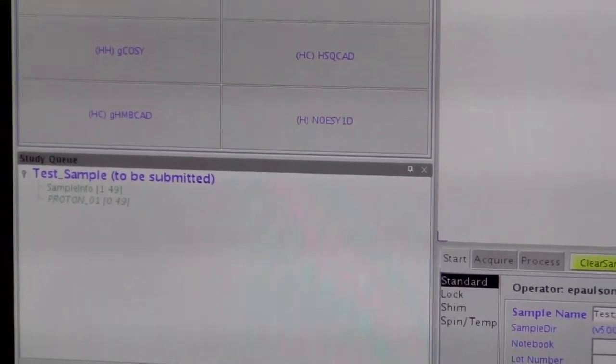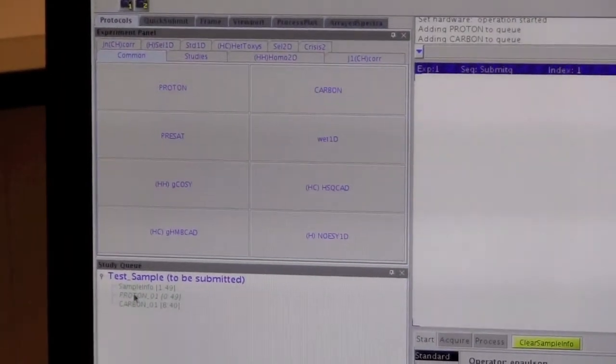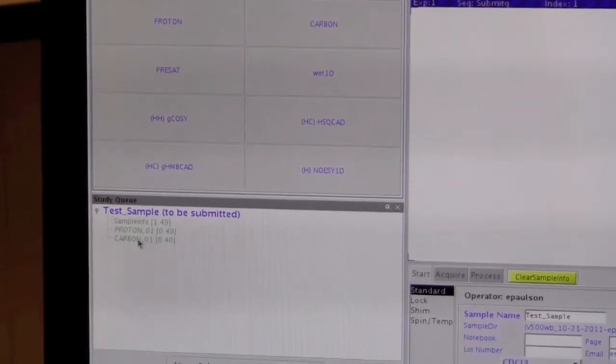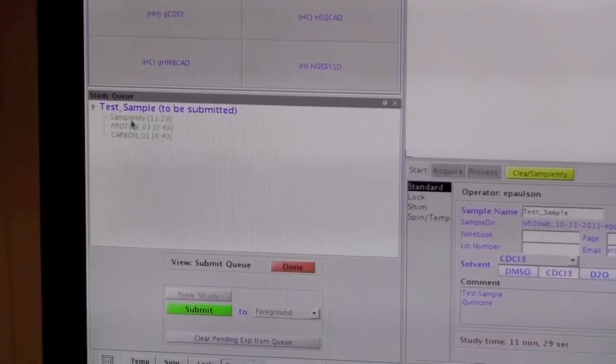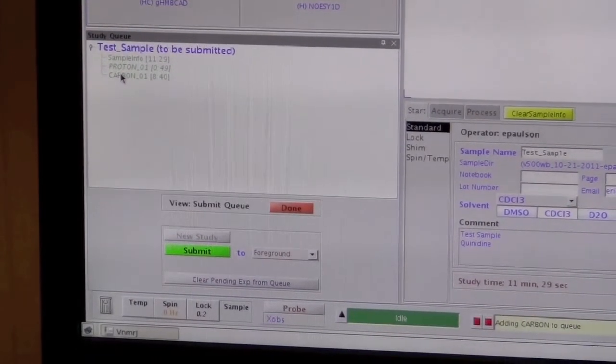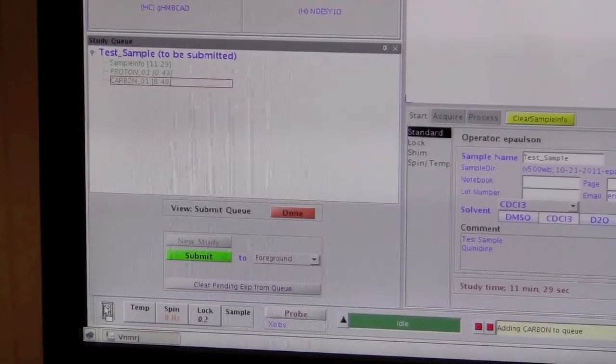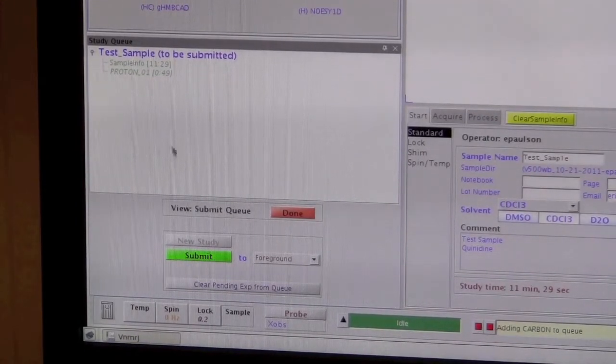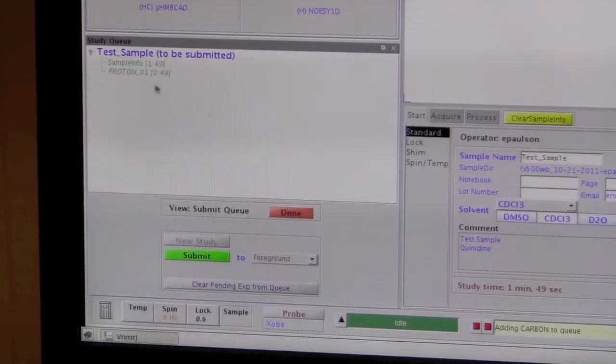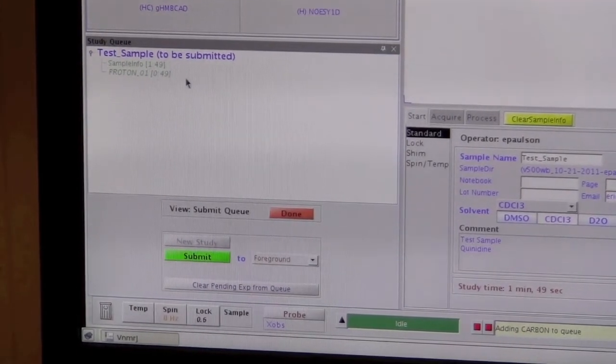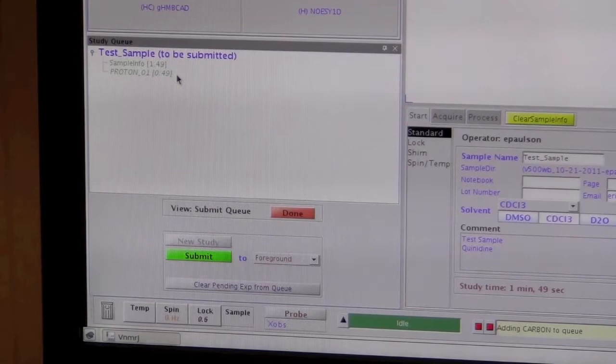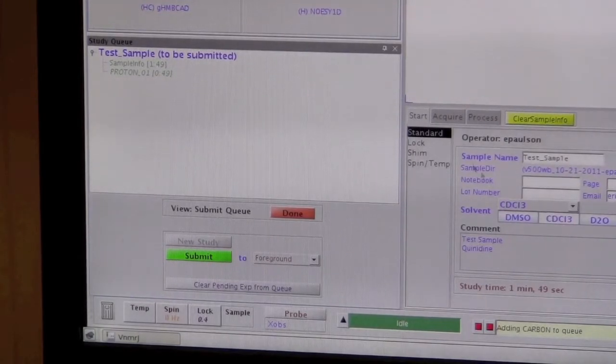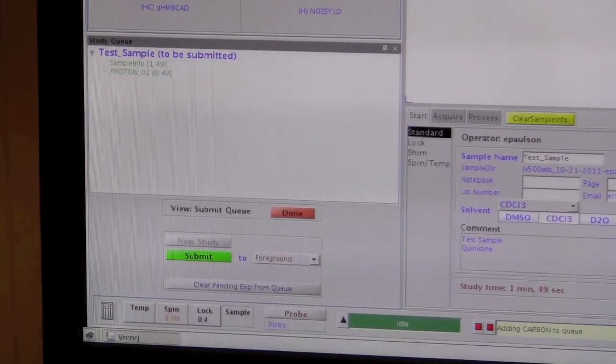If we add other experiments, they will be run back-to-back after the first one that we have. If you add one by mistake, or if you decide not to do it, you can get rid of it by dragging it down to the trash can down here. Now it's gone. Okay, so we have the one experiment we want to run, and it's been set up the way we want. We've got these fields all set up, and we have our sample in the magnet.